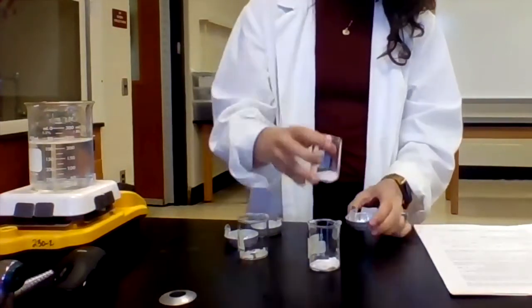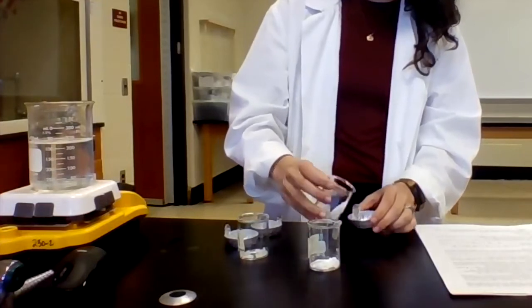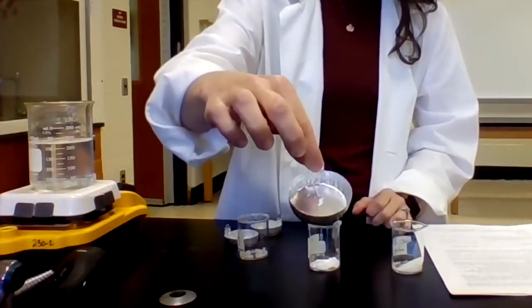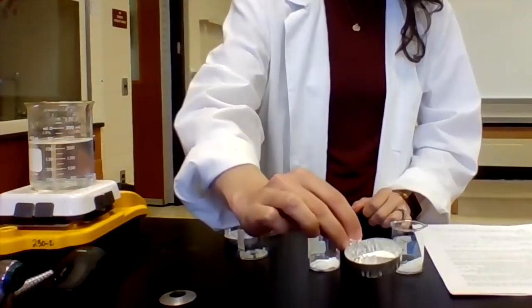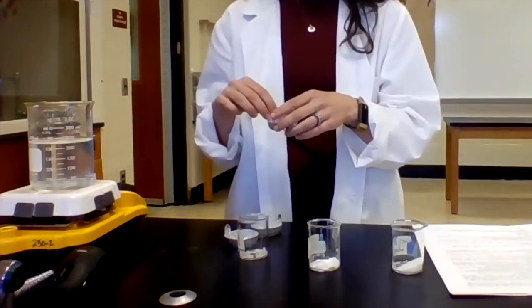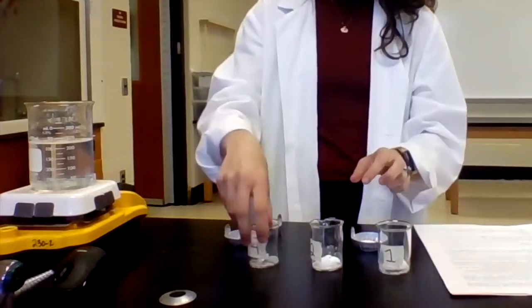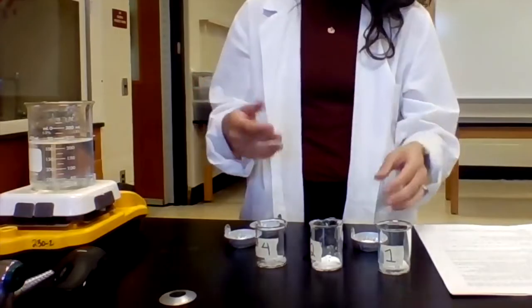So what I'm going to do is transfer just a little bit. I don't need a lot. This is sometimes what we call a pea-sized amount. You can see, it kind of fell. Hold on. You can see there, just a little bit. And I'm just going to hold it over the hot water bath for a couple of minutes and then see if it melts. I'm going to do this with solid 1, solid 2, and solid 4, and then we can see how it looks.